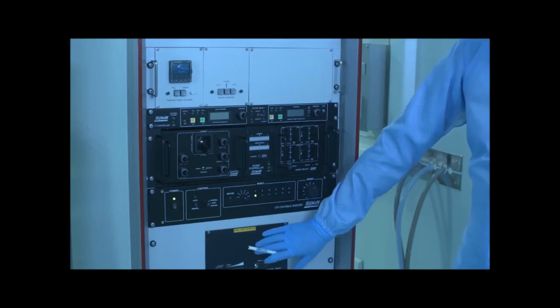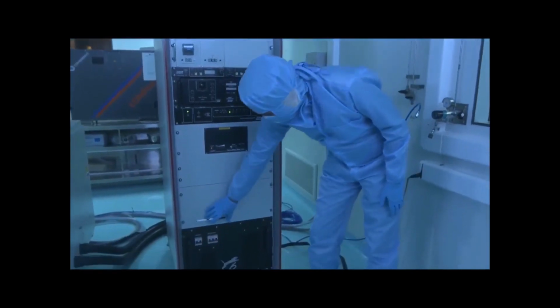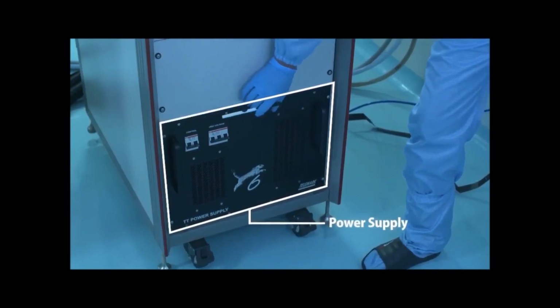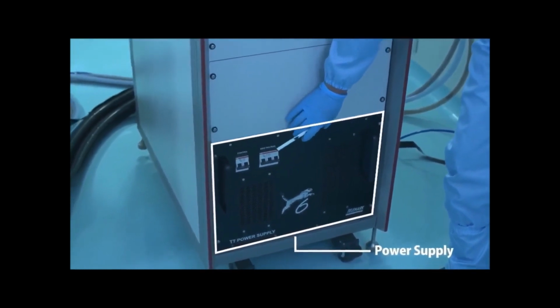So this will show the status of the turbomolecular pump. So in the lowermost part, this is the power supply for the control unit, and we have to switch it off and on when we want to start the control unit.